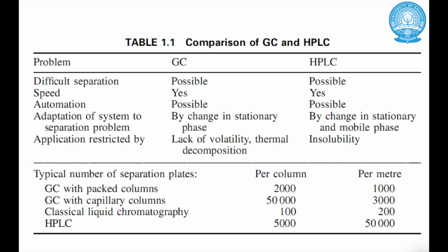So in terms of the sensitivity or in terms of the ability to separate compounds, these two instruments are equally capable of separating compounds.